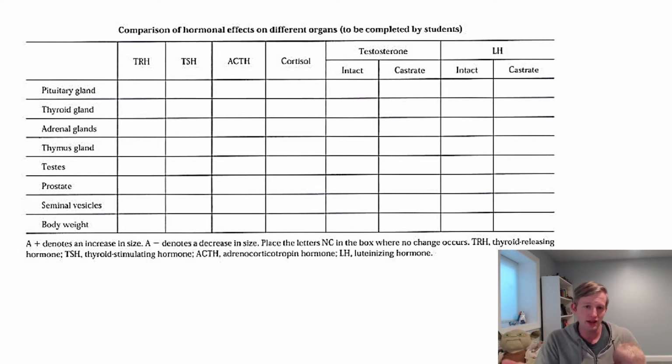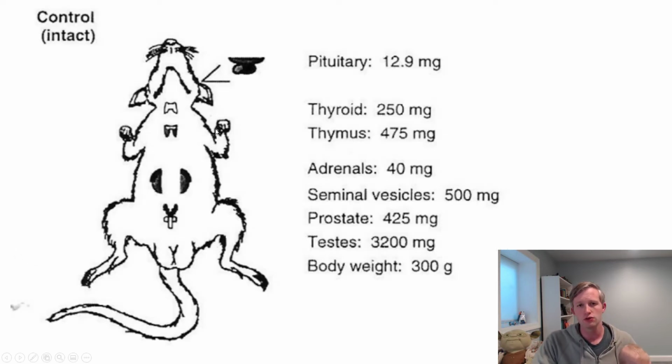And in the end of this, you're going to have some holes in it. You're going to have some spots that you're a little bit unsure of, and that's totally fine, because throughout the experiment, you'll sort of figure out the main pieces that are going to clue you in onto what's going on with your rats, which leads me to the next part. You're going to complete a Google form that's going to assign you 2 experimental rats, and what you're going to be doing is comparing those experimental rats to 2 given control rats.